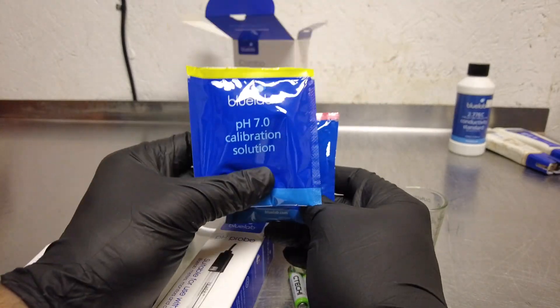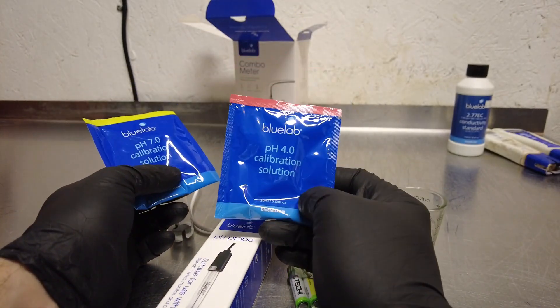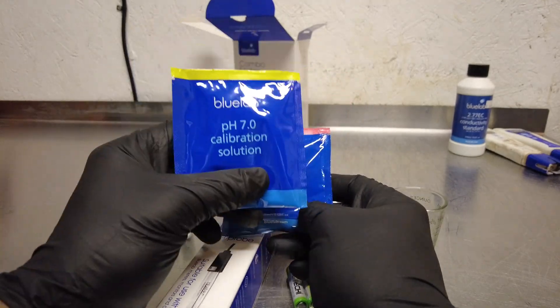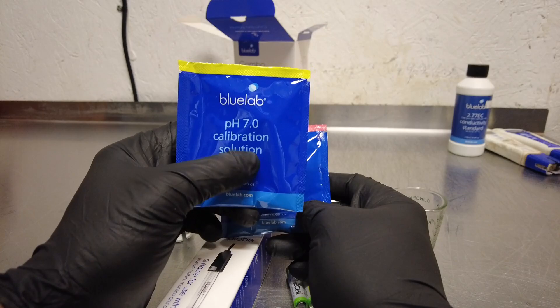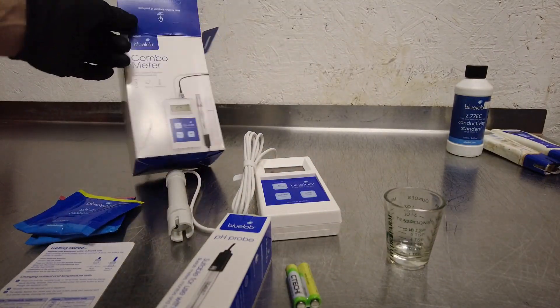The one thing you've got to remember is to always start with the pH 7 calibration solution. You'll calibrate at 7 first and then you can go to 4 or 10 — I know there are some other solutions out there — but you always want to start in the middle with that 7.